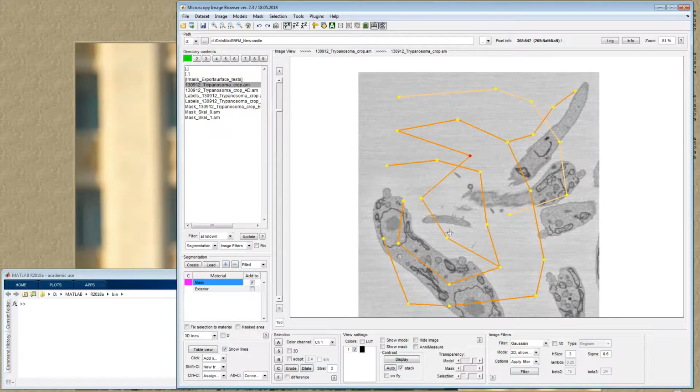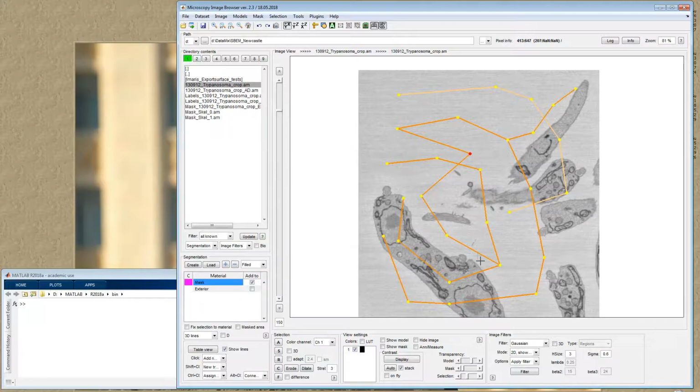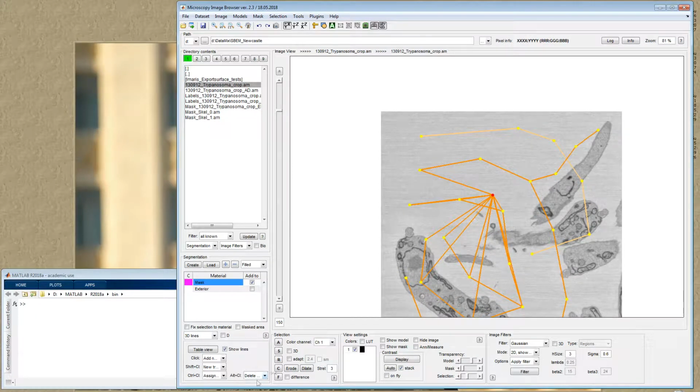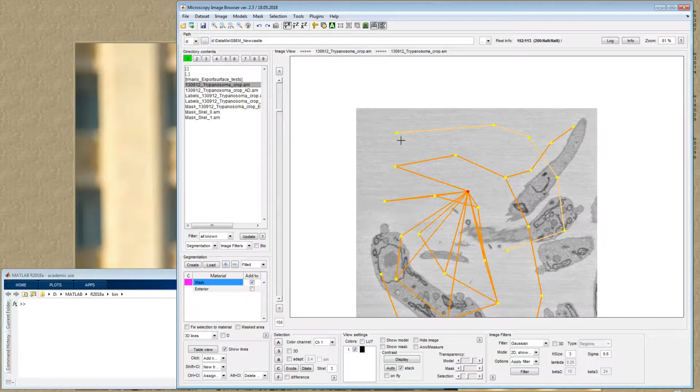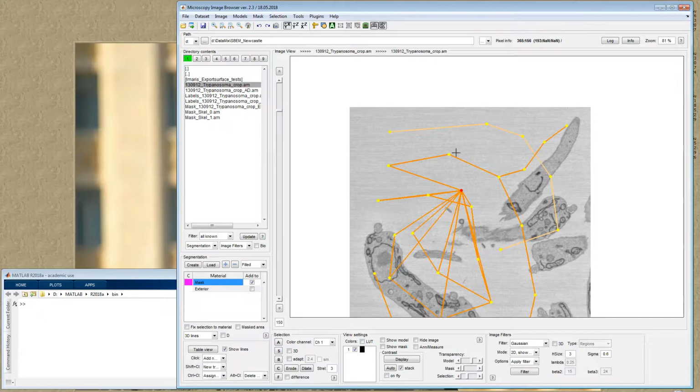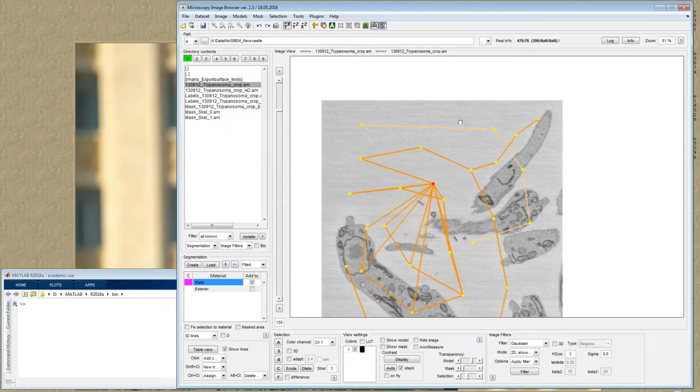Also, we can, for example, make a loop. Like, for example, I want to connect this node to, let's say, this one. So you can see I'm making these loops. I can just connect it to anywhere within this tree. The following action is delete a node. In this case, again, I will be mounting it for demonstration on this Alt click combination. Then wherever I click, it just deletes the node which is closest to the point where I click, like this.